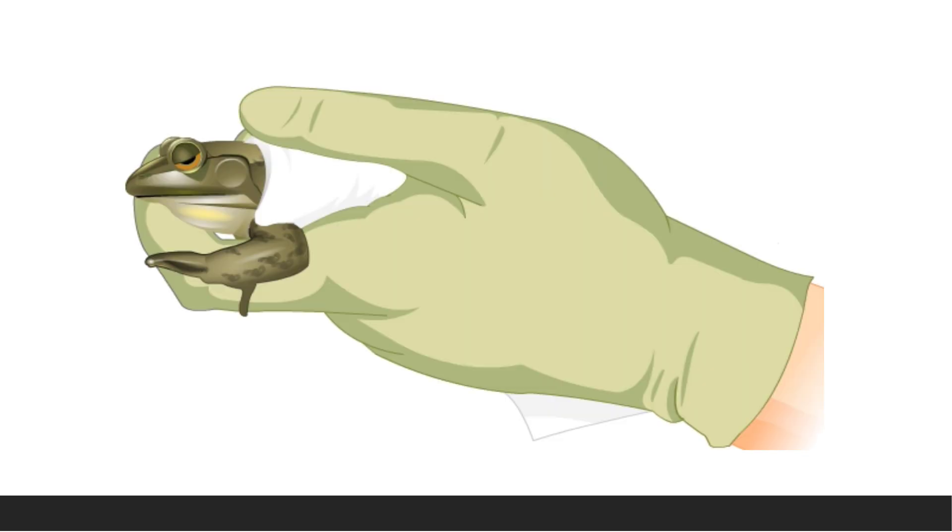The second step is pithing. Pithing of the frog is done so that the animal does not feel any pain during dissection. Pithing destroys the brain and also destroys the spinal cord to abolish spinal reflexes, so the muscles become flaccid and dissection becomes easier. Pithing is done using a pithing needle.